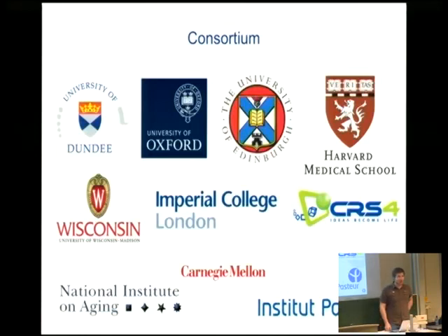So we have this kind of consortium model. I'm from the University of Oxford, Elijah's from Dundee, and this is just the people who are invested in the project at a funding level, but there are also loads of other people invested on a community level. We actively solicit developers who are working in a microscopy or biological environment, because they have such a unique perspective on what's really required, and they can build individual tools which are actually useful to users. That's what I am, so I'm at the University of Oxford building tools which are specific to our users.